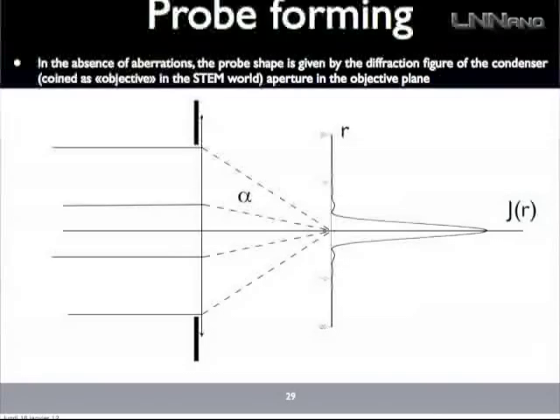So this is here just drawn with geometric optics, but of course, as you know, electrons are quantum beasts, and when you are using STEM or TEM, you really have to consider it. So in fact, if you look at the density of electrons that has been formed in that way, you will see that you have, in fact, an Airy function, which is, in a word, just a very peaked function here, and you have some wings here, some oscillations.